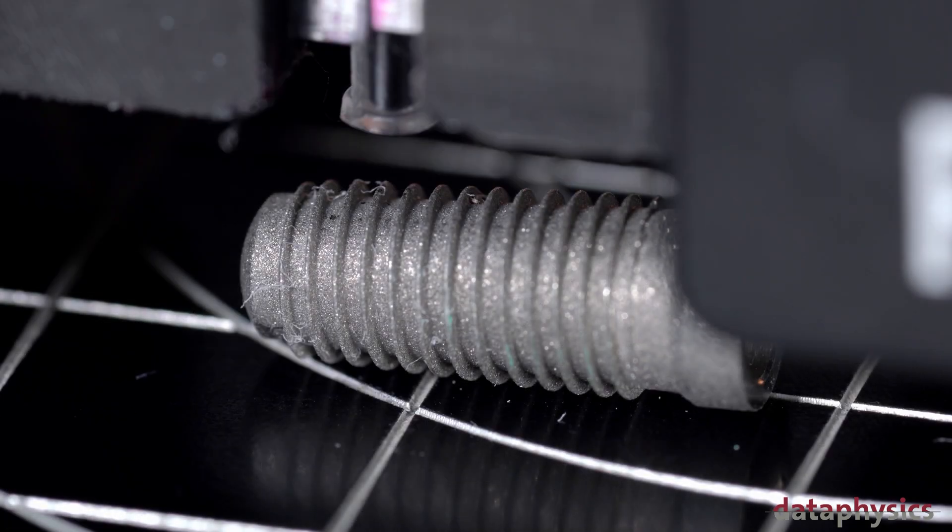The picoliter dosing system is capable of dosing individual droplets down to 30 picoliters in size. These tiny droplets enable measurement of contact angles on the individual wires of a stent or inside the screw threads of a dental implant.